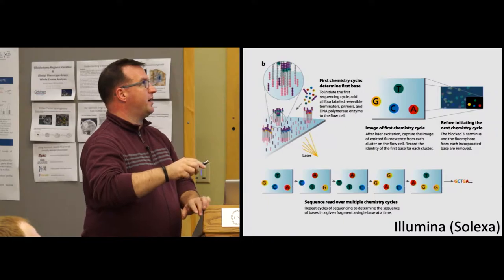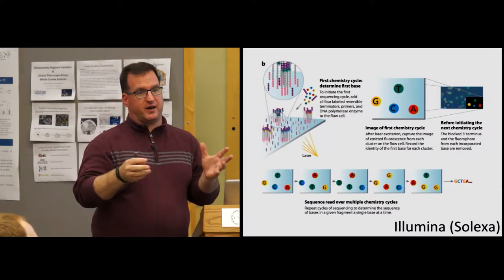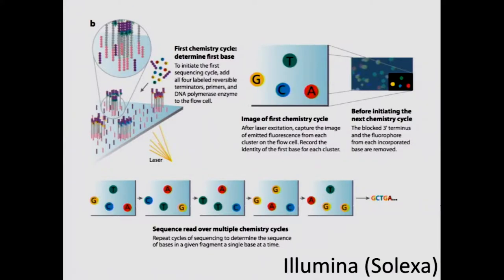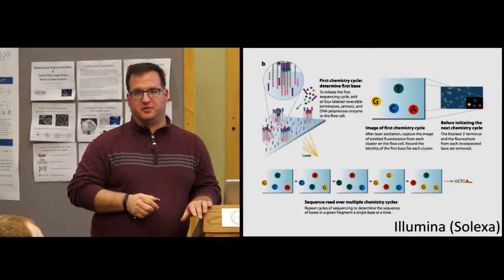So that's why Illumina reads are essentially limited. There are two reasons why Illumina reads are limited in size. One is that with this bridge amplification process, if you put in a 1,000 base pair molecule, that molecule has so much entropy that it doesn't really like to bridge. So the fragment itself has to be small enough that biophysically it can tolerate making that bridge structure. But the other reason is that as you get out to increasingly long cycles, that phasing problem becomes more and more of an issue.